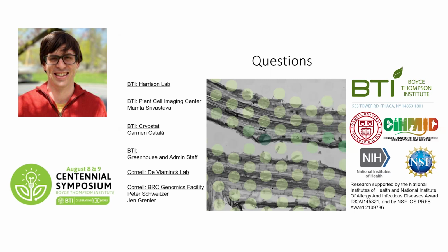I think you mentioned this, but can you remind us, when you lay the sections down, how thick are the sections? How many cells thick are they? So these are 14, actually 18 micron sections. They can vary depending on the cell type. So it can be between maybe 1 to 2 cells thick, but in some areas it could even be 4 cells thick, maybe.